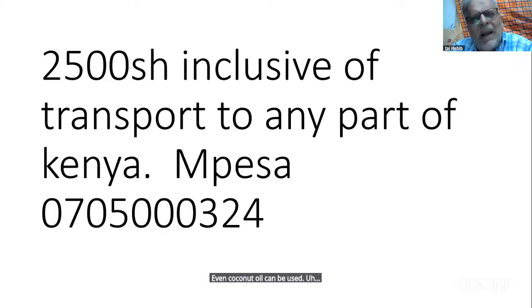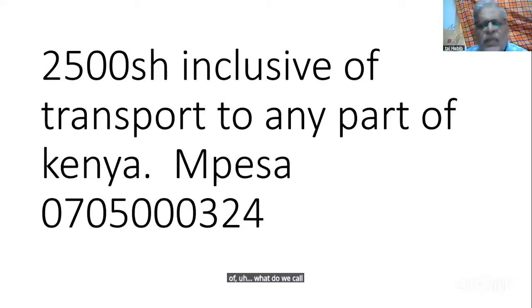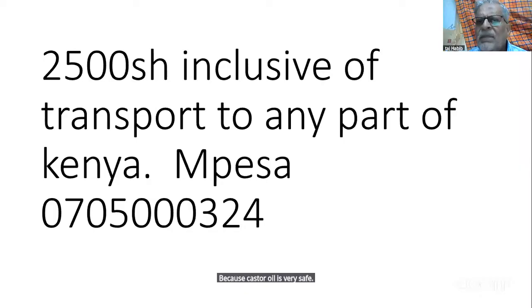I would stick with castor oil because it has been verified and used for many, many years before the coming of artificial oils. The natural oils were always castor oils. But it is your choice. You can try it. I hope it doesn't damage your objective, because castor oil is very safe. The safest oil you can use is castor oil, and it doesn't dry.